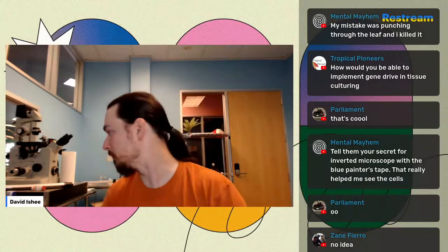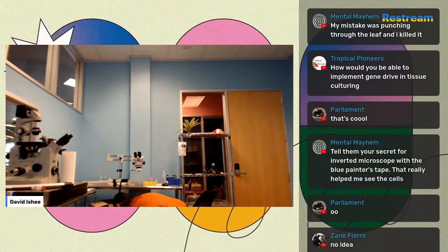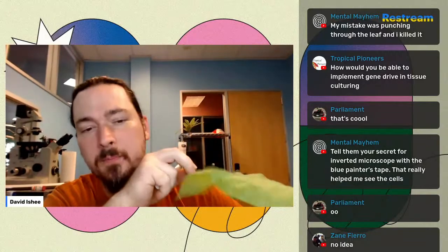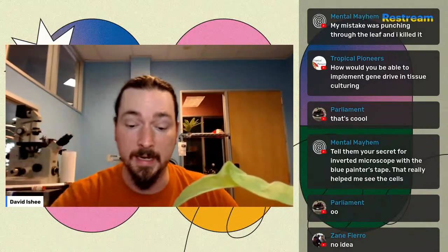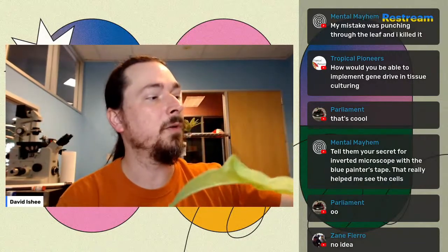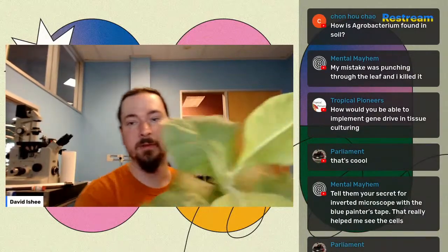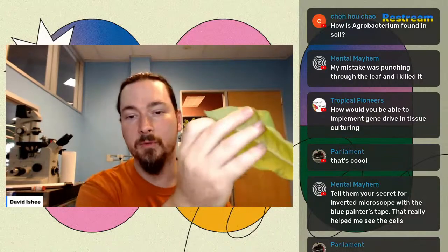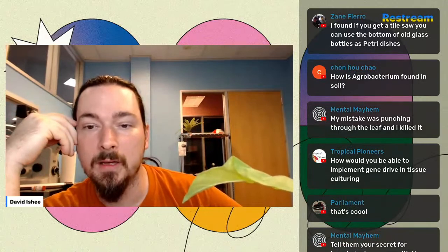So this is really common, punching through the leaf. It's just tricky, right? This is something that happens a whole lot. Tobacco leaves are pretty soft, right? Which is, I'm pretty sure, the reason people really like them, and part of the reason it works so well, and the reason people have spent a lot of work trying to make it a model organism. You look at this plant, this thing's all leaf. You've got a lot of nice, soft, pliable, big leaves to work with.